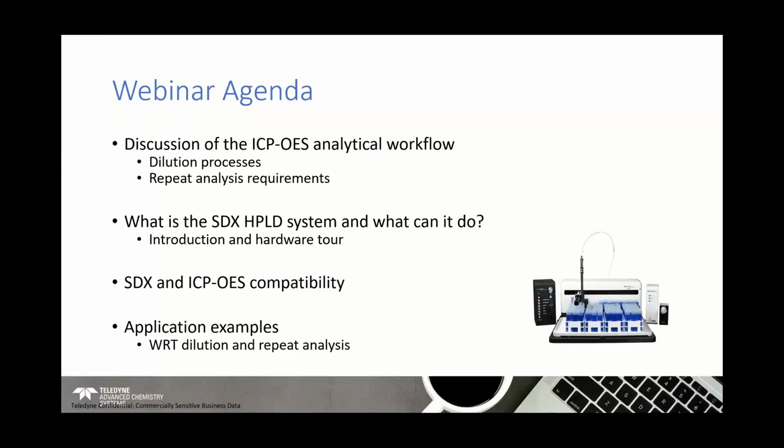I will go through compatibility with ICP OES instrumentation briefly, and then from there I want to essentially theoretically apply what we've been describing through workflow, through the SDX system, to certain applications, again with respect to dilution processes and repeat analysis. So that's the agenda for the webinar, so I shall make a start.